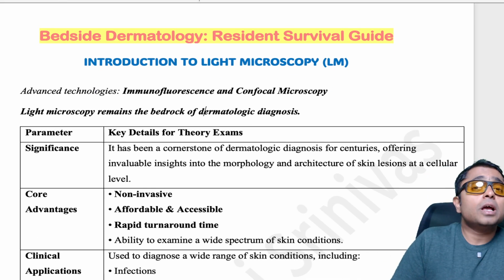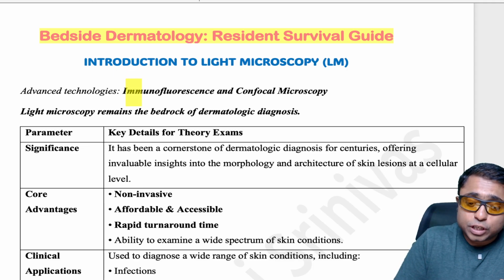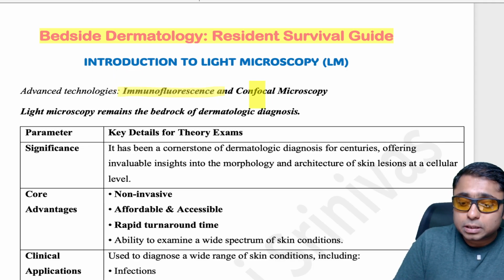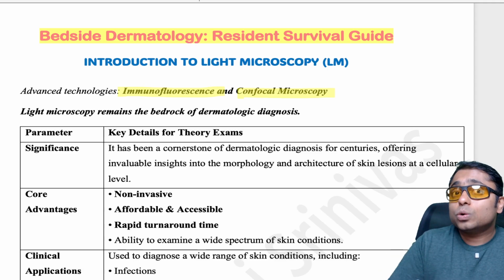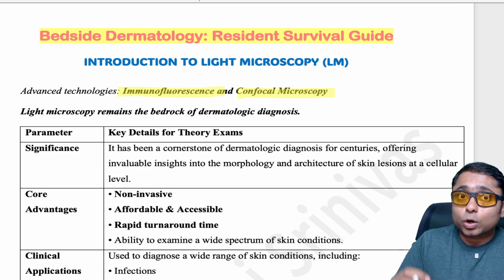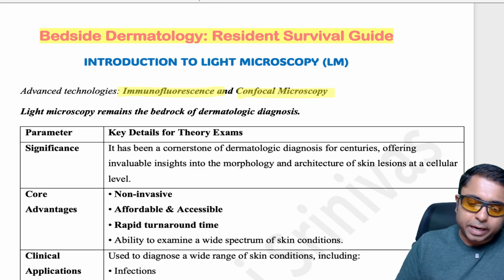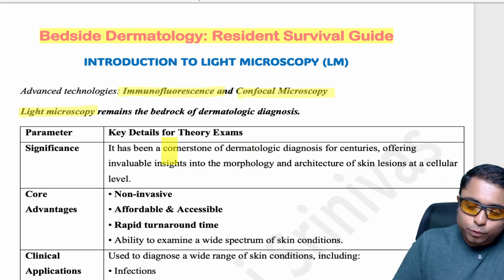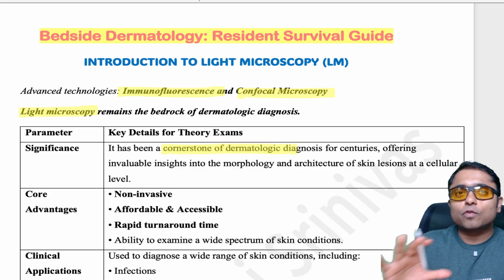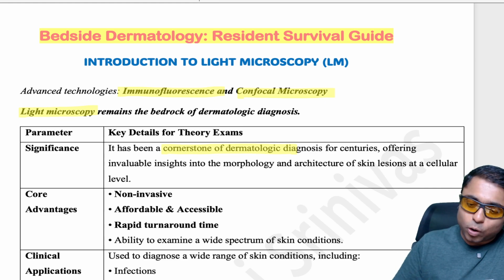But before that, you may be aware of the various advanced techniques which are already available, like immunofluorescence, direct, indirect, and confocal microscopy. By the way, these are also very important topics which you need to know as theory questions. We are going to discuss them in a separate video. But here our topic of discussion is light microscopy, which has formed the cornerstone, the bedrock, of dermatology diagnosis for centuries and even further.